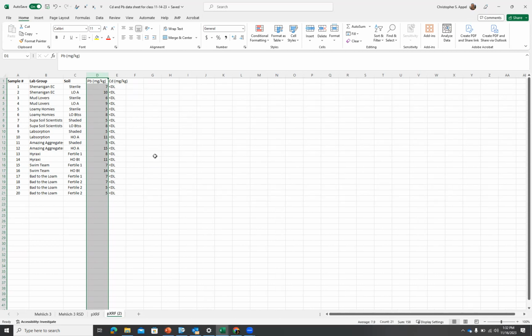Even if you get stuck or get behind on something, you can follow along by looking at the recording, and I will email you the spreadsheet with all the completed data.